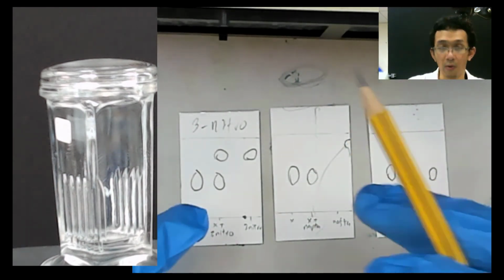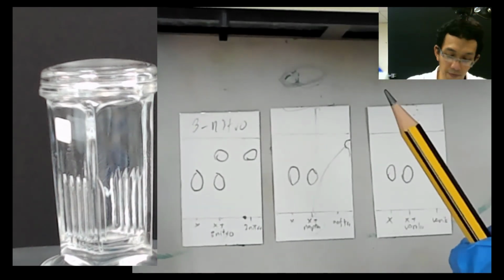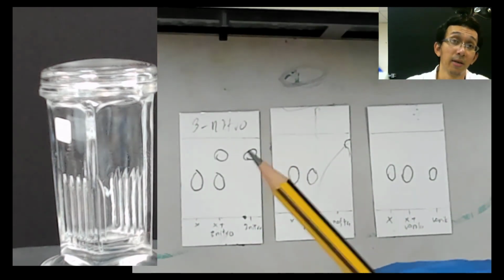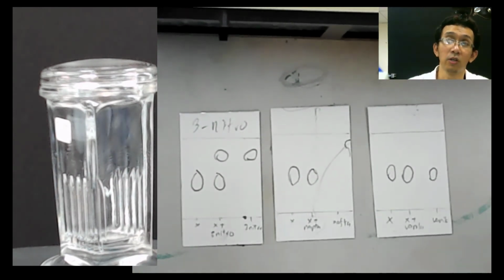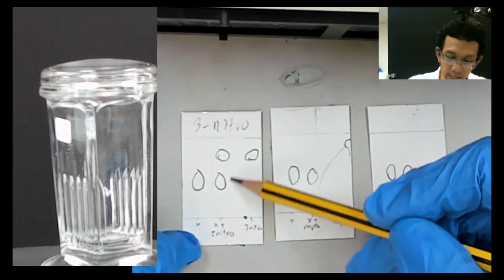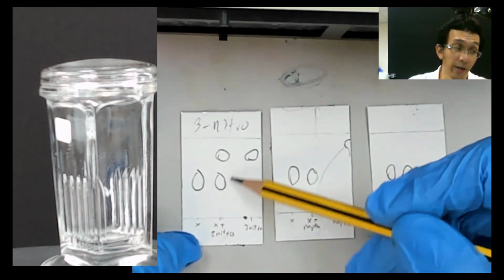Okay. So now, last question. In terms of RF, when RF is lower, when RF is less, what does it mean? Let's say you have RF 0.2 and RF 0.8. If you compare this thing, which one is RF 0.2? Which one is RF 0.8?